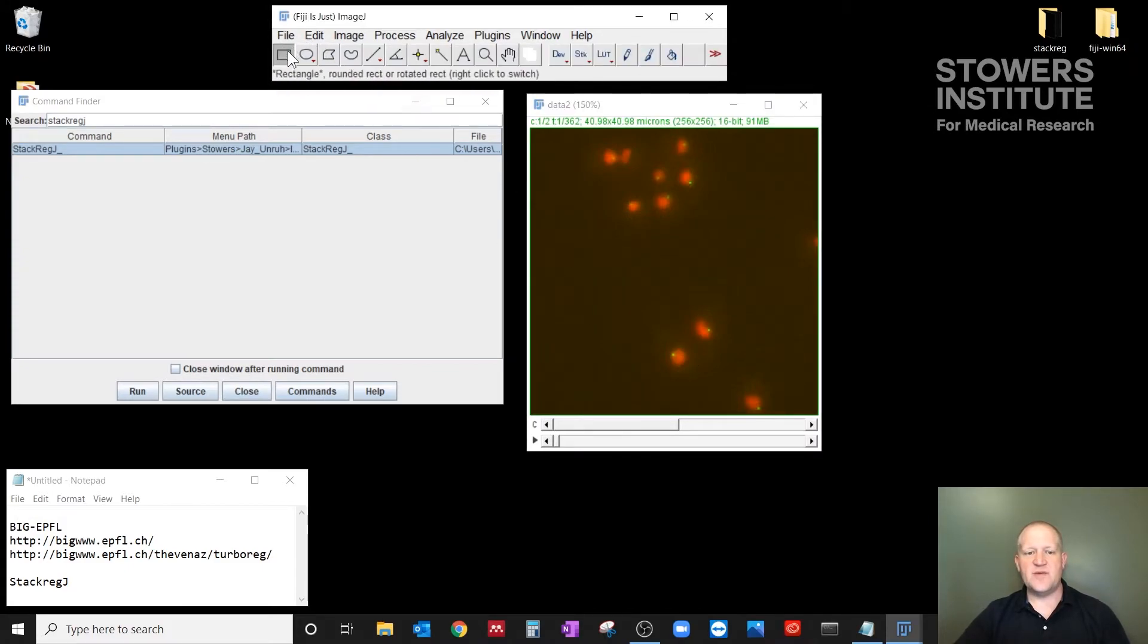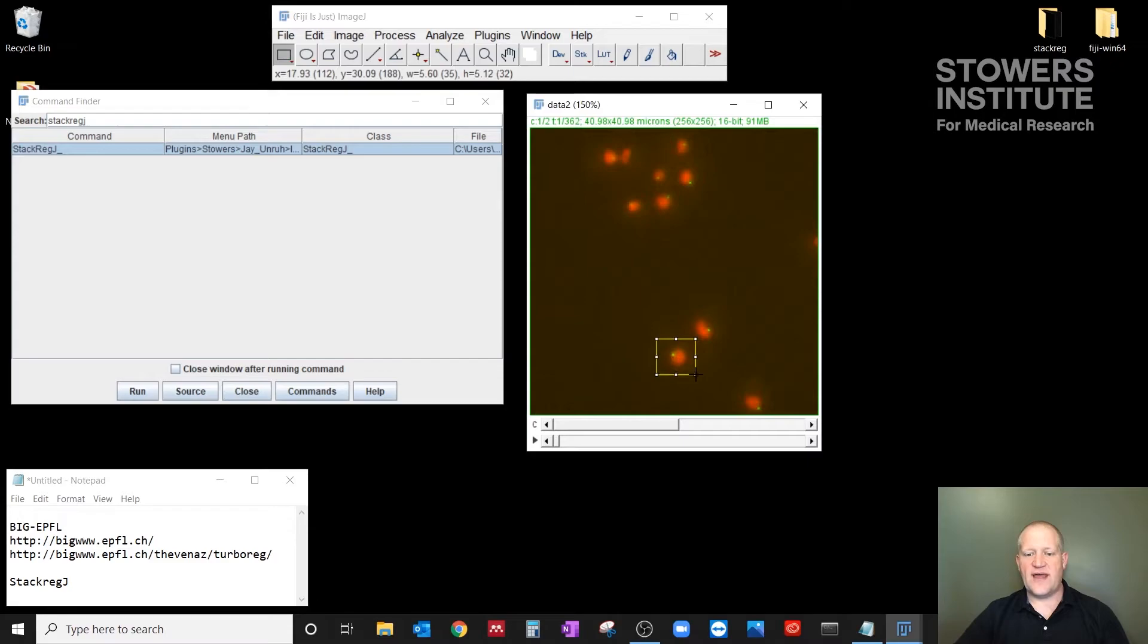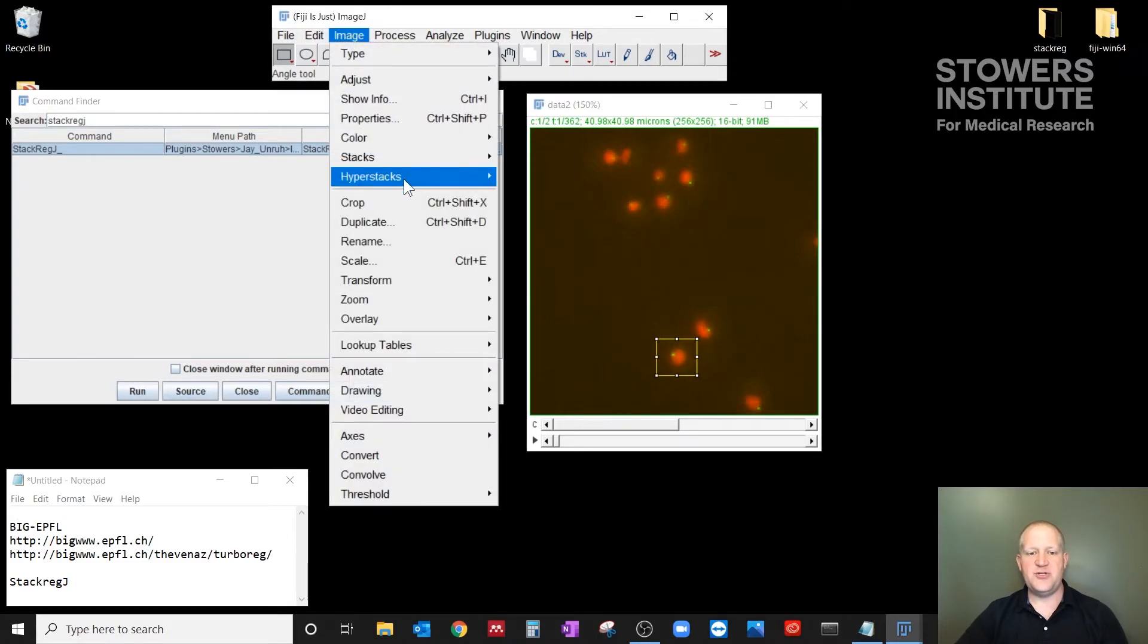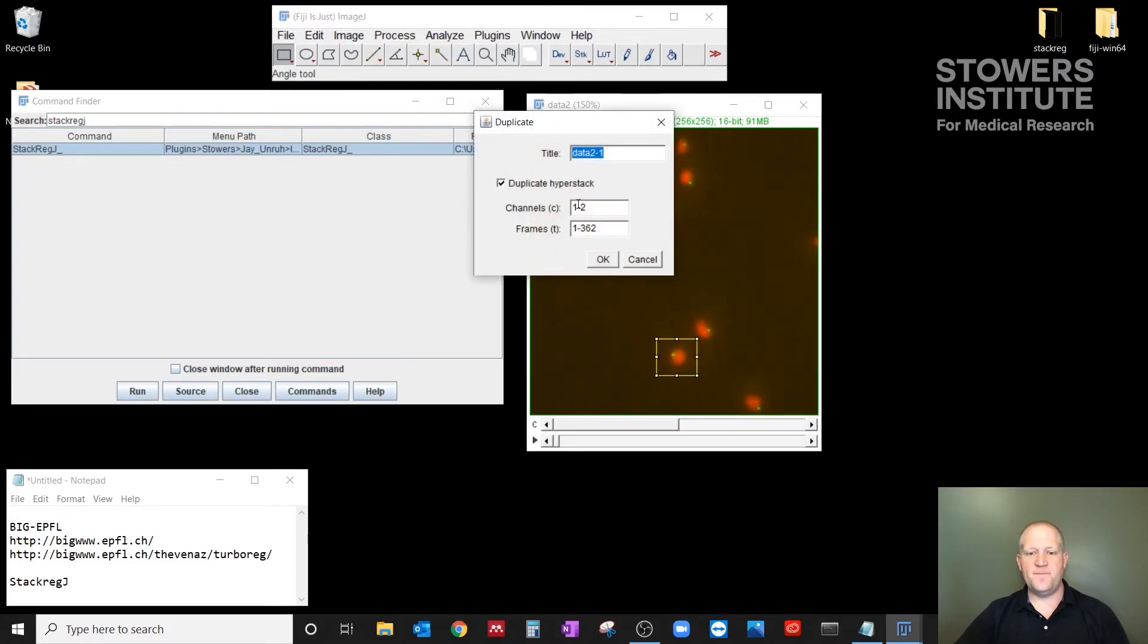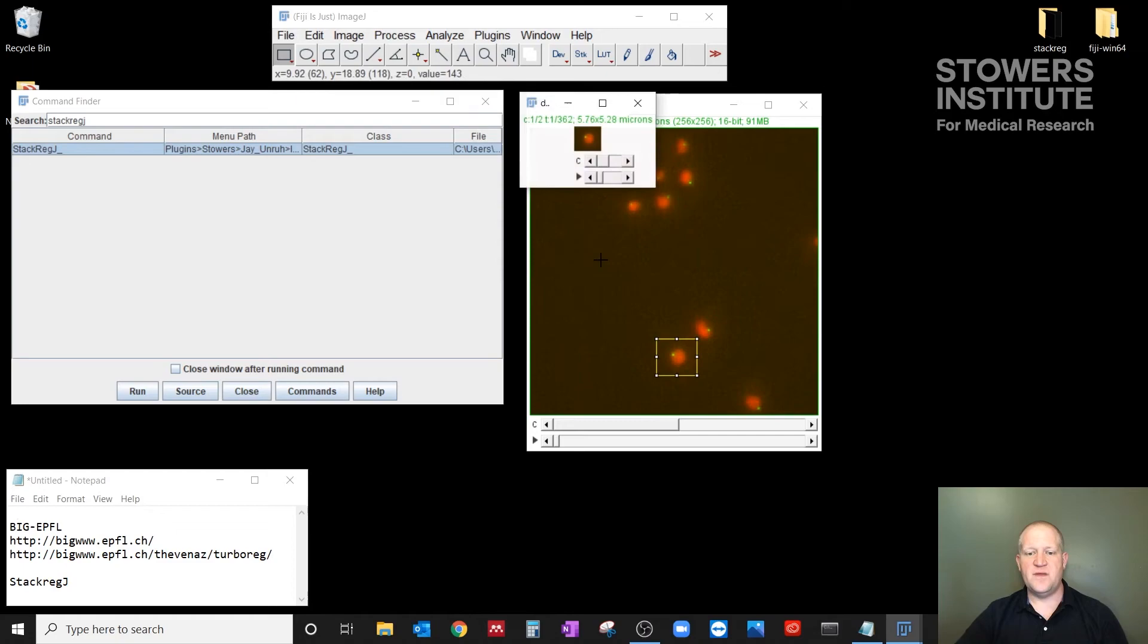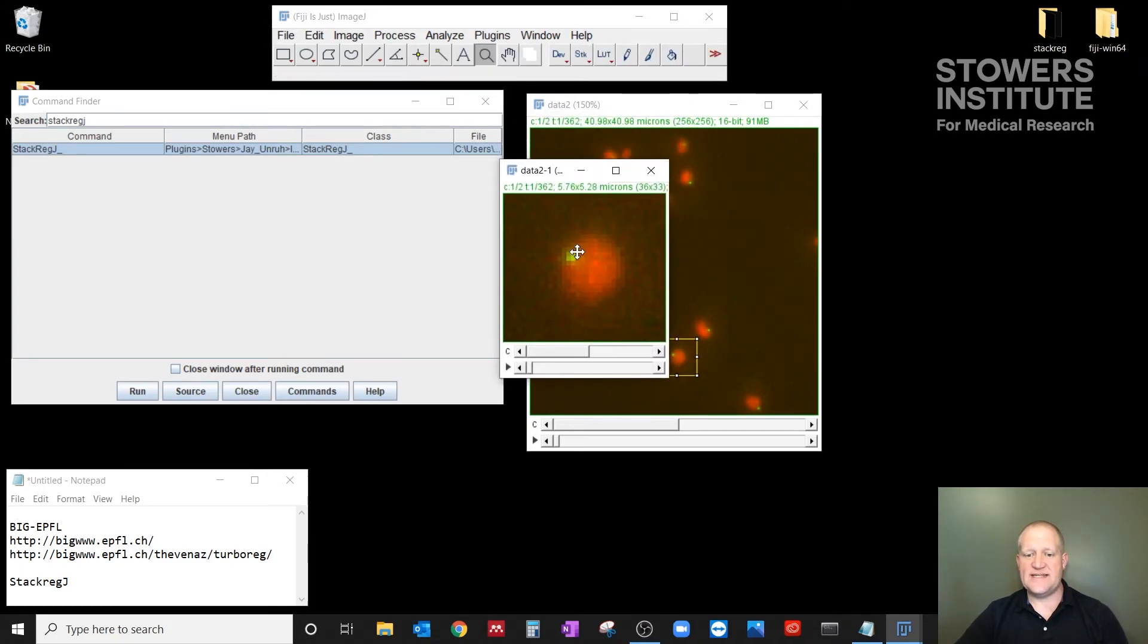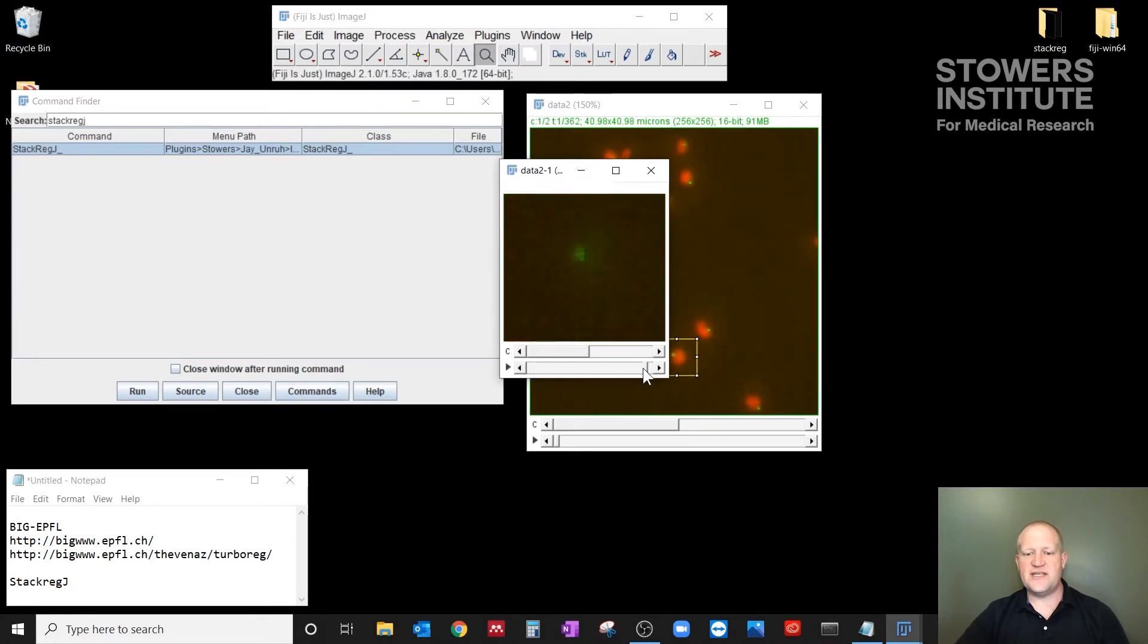So what I'm going to do is select my rectangle tool. And I'm going to draw a rectangle around a cell. And then I'm going to duplicate that ROI into a new window by clicking on image, duplicate, and I'll give it a new name. And I want to duplicate the whole hyperstack, red and green channels in all time frames. So now I have this little window, which is the same scale and the same intensity as it was before. And if I play through this movie now, you see how much the telomere wanders around.